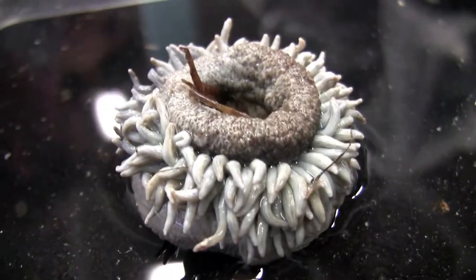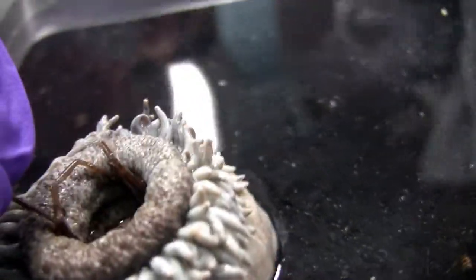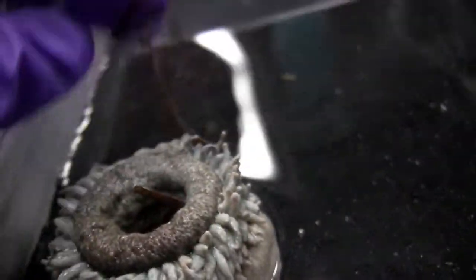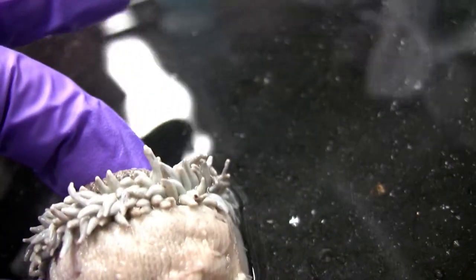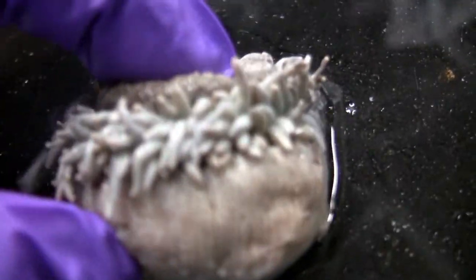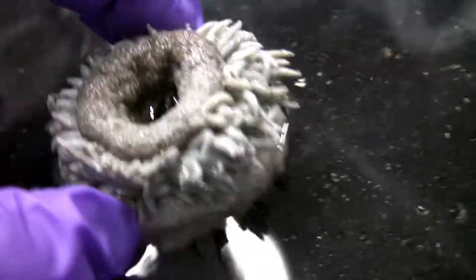I'll put him open, see what he got inside his mouth. What's this in his mouth? It's like algae and stuff. So the oral is right in the middle. His little foot, his little tentacles. So this guy has been preserved in formaldehyde.